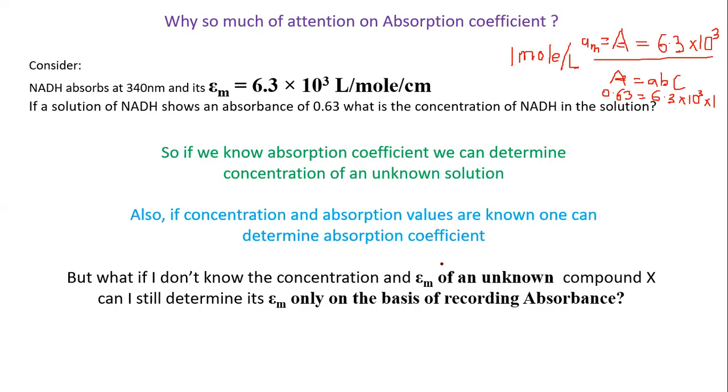So we'll have to identify X first. But you have prepared the solution of it. So how will you go for identification now? Sir, we will prepare a range of samples. How? I have given you one solution of X, right? With that only you will have to deal. You cannot take extra X because I have dissolved everything. I have given the solution to you. Now you tell me how you will proceed.